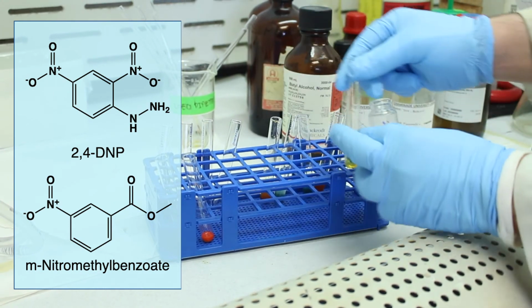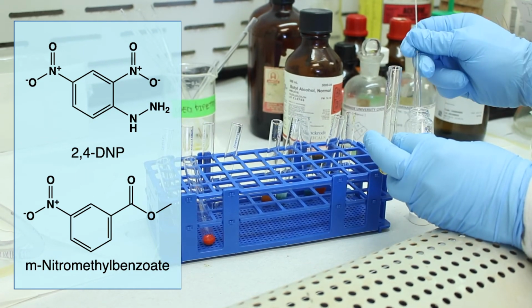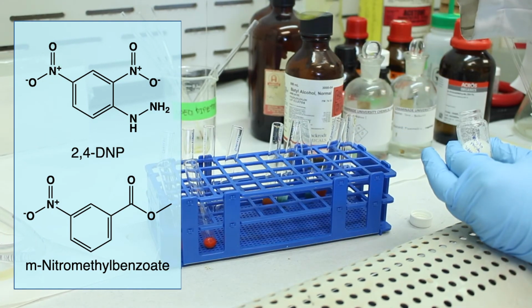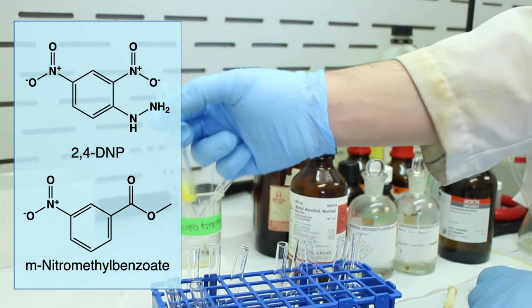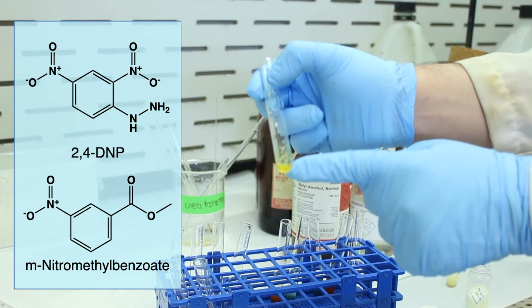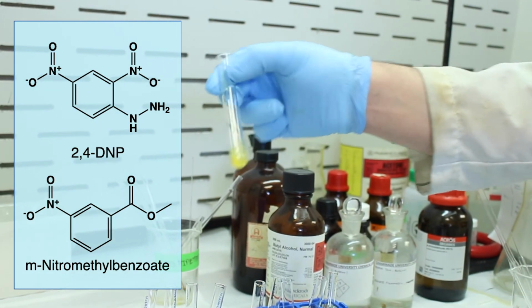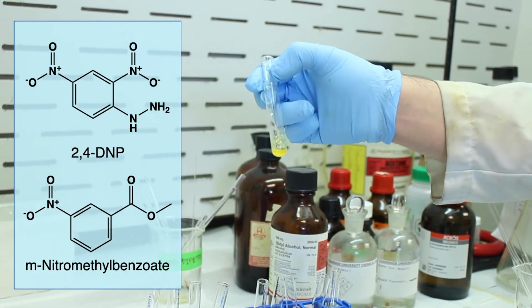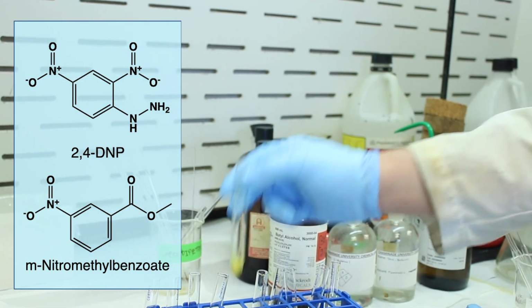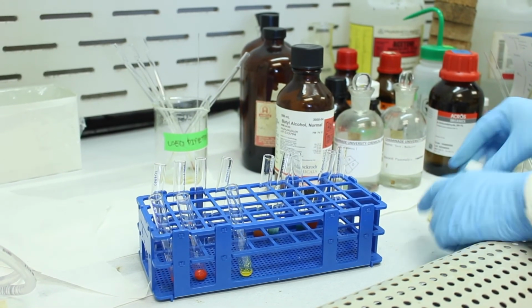So we'll take a little bit of our product. I'll just use a little pipette to grab some solid. We'll add it. And as you can see, no reaction. You basically just have a suspension of this solid in the DNP. There's no orange color change. So esters, and for that matter, amides and carboxylic acids do not react with DNP, only aldehydes and ketones. Nice. So the final test is going to be our bromine test.